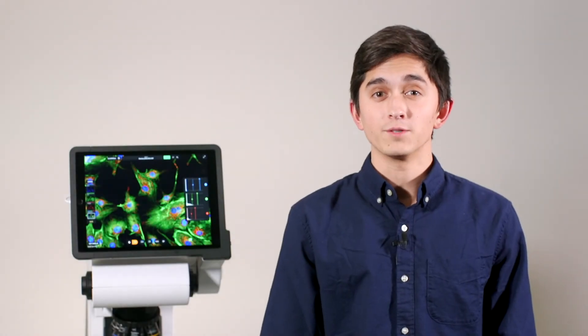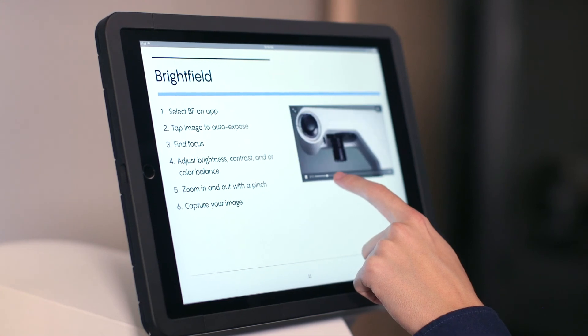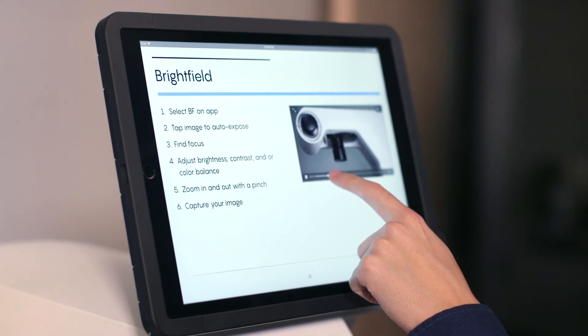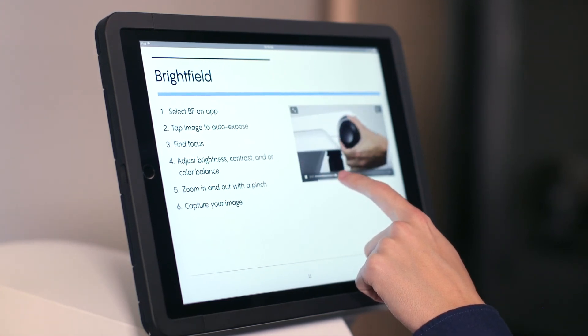As you can see, the Revolve is a highly intuitive instrument. By reducing the learning curve, you can now focus more on your research, rather than spending time being trained on the microscope itself. With each Revolve, there's also an interactive iBook, filled with clear instructional videos, to help you get started.